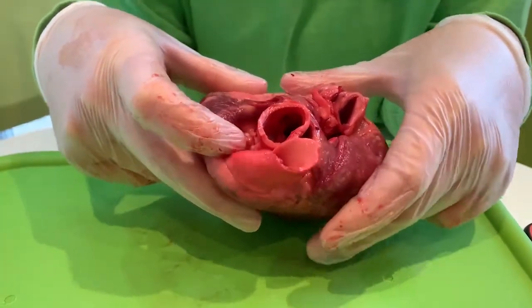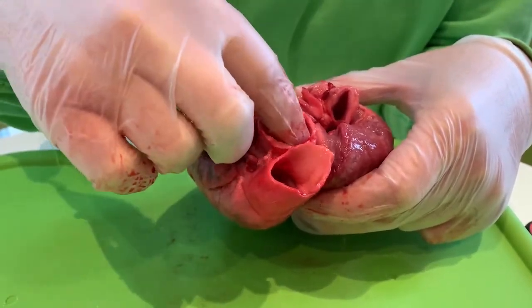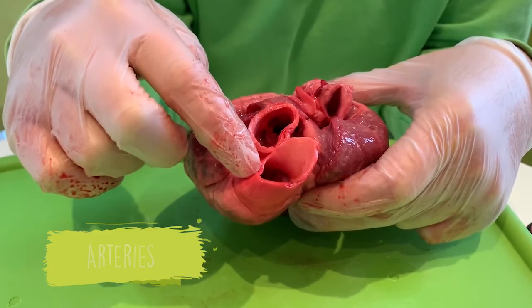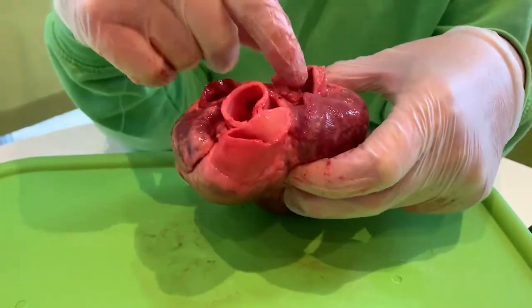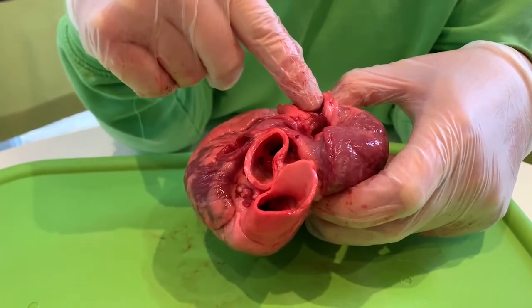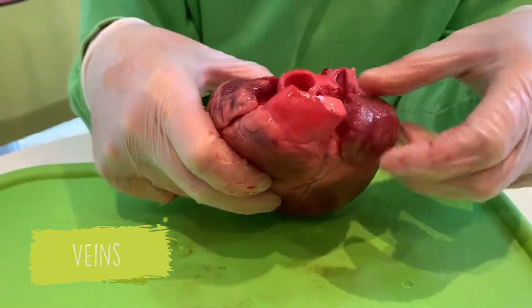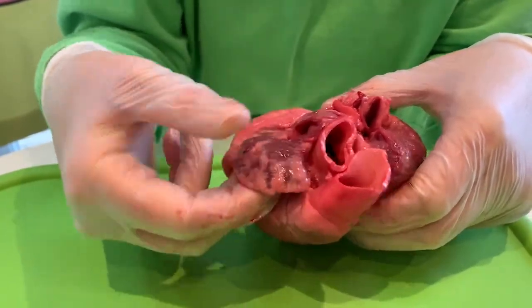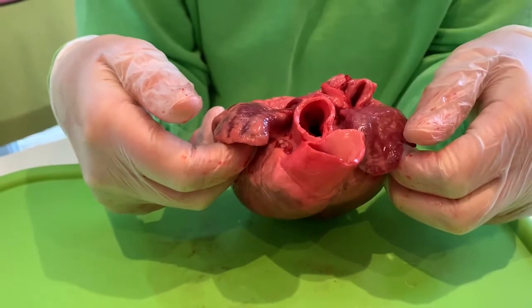Let's look at the tubes at the top of the heart. The two tubes here are quite light. The walls are quite thick, and these are the arteries. So these are the arteries that carry that nice, fresh, oxygenated blood. These ones, 1, 2, are a little bit darker, a little bit thinner, and they carry the deoxygenated blood. So these tubes are the veins, okay? And then these little bits here, this little bit on the left side, and this little bit on the right side, this is the atria, the first little room, or the first little chamber that the blood comes into, all right?